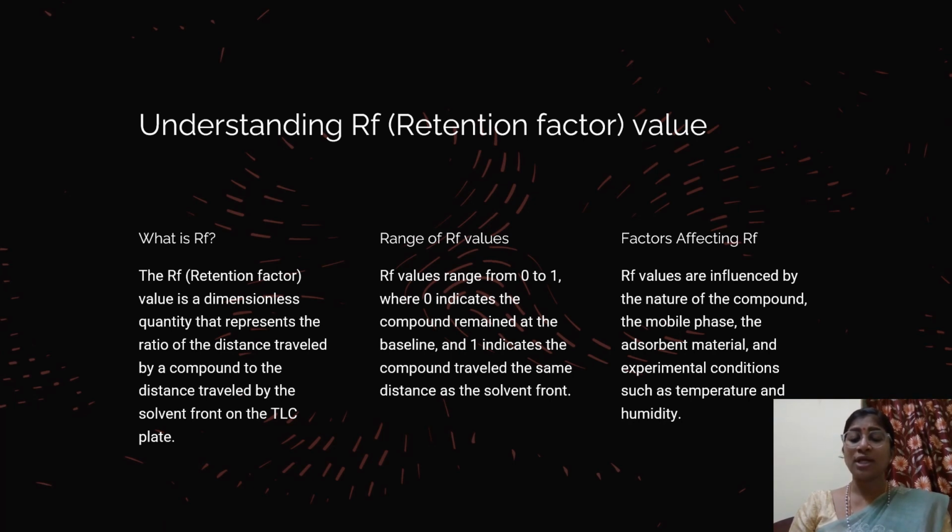Rf values range from 0 to 1, where 0 indicates a compound remained at the baseline and 1 indicates the compound traveled the same distance as the solvent front. Rf values are influenced by the nature of the compound, the mobile phase, the adsorbent material, and experimental conditions such as temperature and humidity.